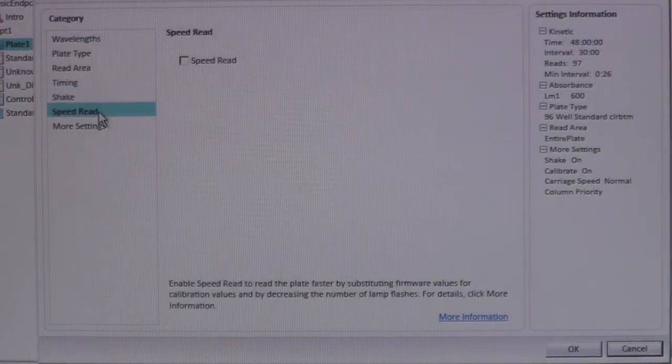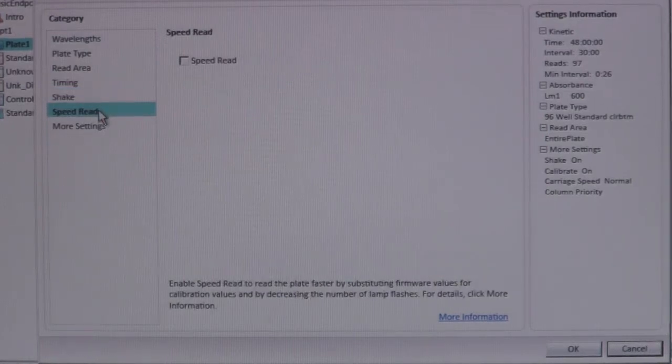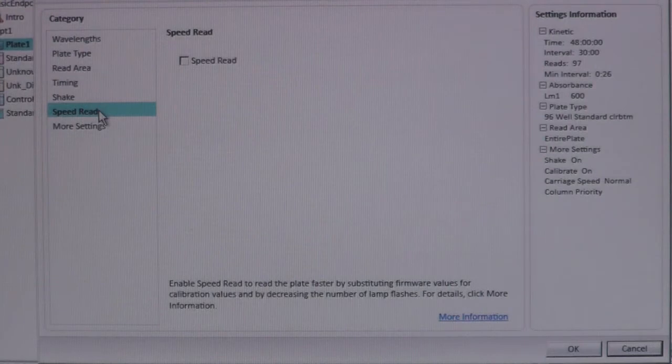Speed mode provides faster well reading, but can result in less accurate results. It should be used when shorter read intervals are applied.